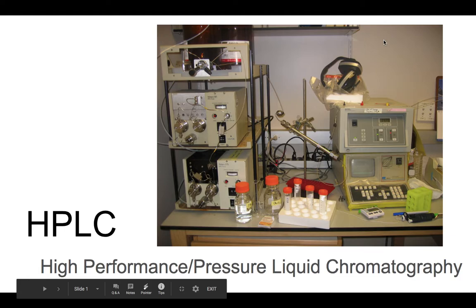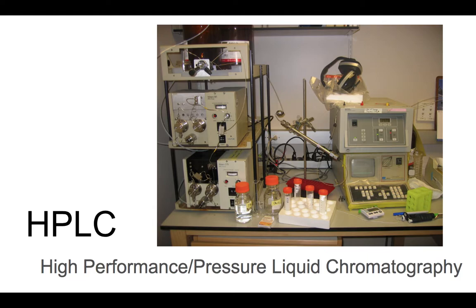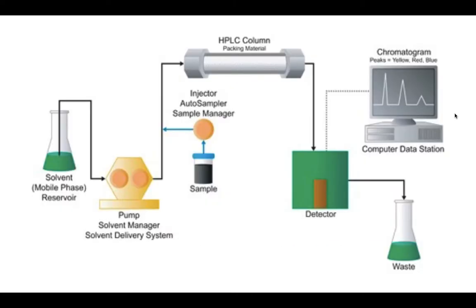High-performance liquid chromatography, also known as high-pressure liquid chromatography, is a separation technique using the principles of chromatography and is a derivative of column chromatography. Chromatography is a separation technique that relies on the unique polarities of each compound, therefore allowing them to be separated out of the analyte. In chromatography, the solvent moving through the column is called the mobile phase, which is used to carry the analyte over the stationary phase. This can either be polar or nonpolar.